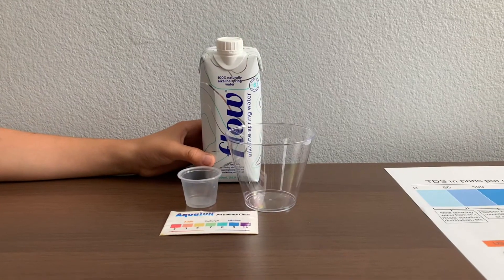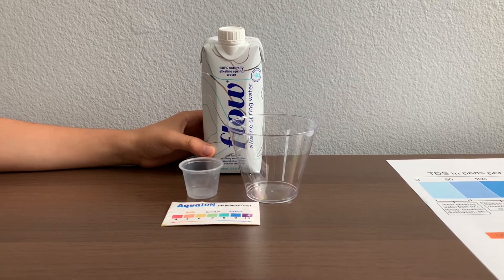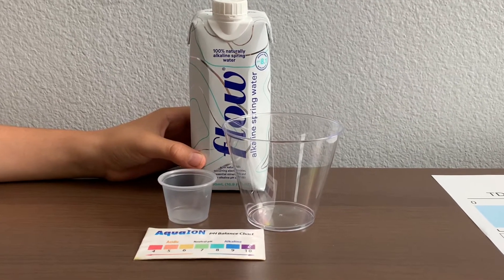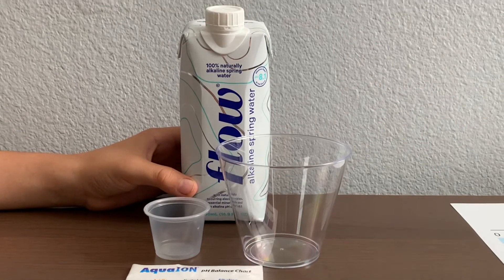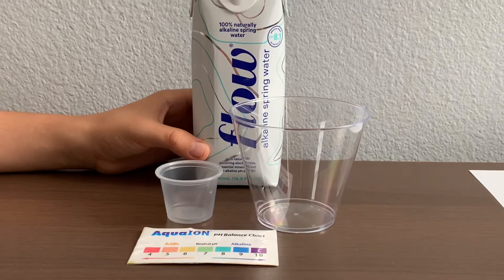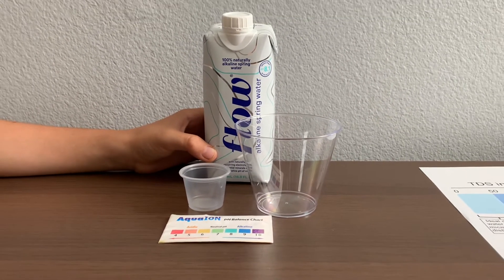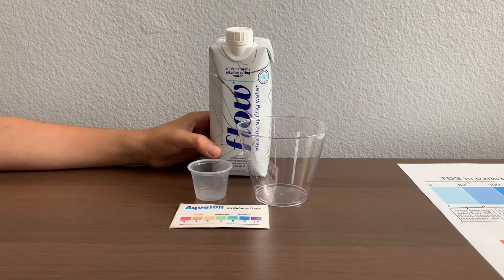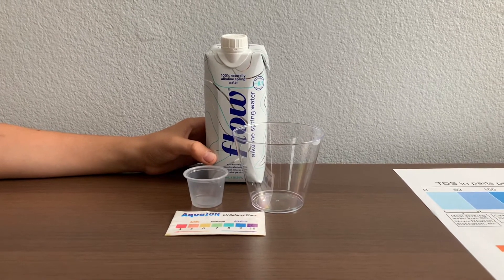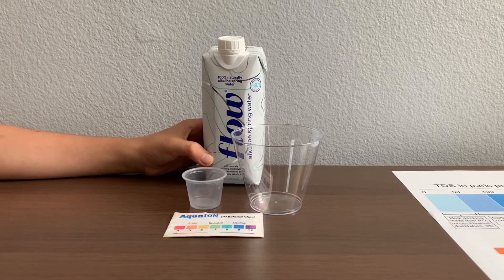This is Flow alkaline spring water with naturally occurring electrolytes, essential minerals, and an alkaline pH of approximately 8.1. This Flow water is sourced from Virginia, USA. Two years ago, we tested another Flow bottled water which was sourced from Canada. You can find that video on our YouTube channel. Let's compare and see if there's a difference.